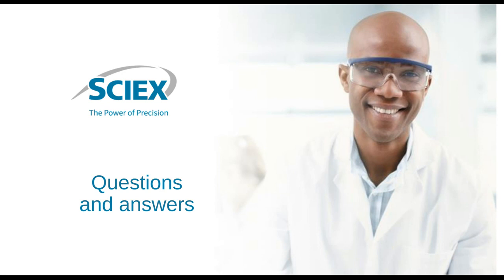So if there's a large amount of residual DNA, you certainly want to dilute it out to the point that you're not maxing out the detector. So that's the first thing. You also want to make sure that you have an optimal concentration of dye in the gel. That was one of the things that we looked at, is what is the optimal concentration for low levels. And you can kind of see a curve where you hit an optimal point for low levels of trace DNA, but if you have higher amounts, that ratio of dye to gel might not be optimal anymore. So that's another thing you have to watch out for.